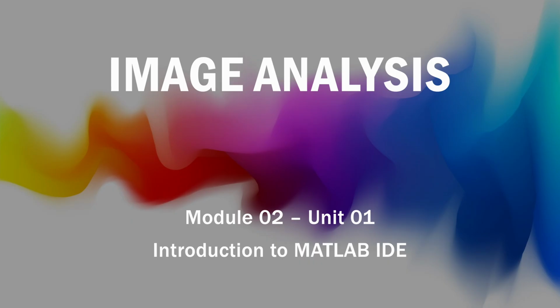Becoming familiar with the IDE will help you work efficiently by understanding how to navigate its features, manage your workspace, and interact with your code. This foundation will make future tasks in image analysis smoother and more productive.